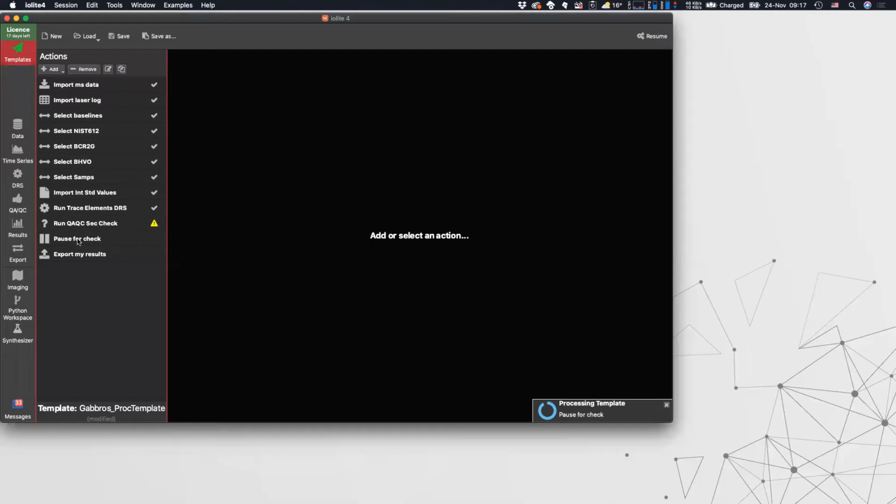And now it's waiting for us to say that it's okay to continue and to export our results. That probably took a couple of seconds, maybe 3 seconds, and I don't think there's anyone who can click with their mouse fast enough to beat that. So that's just to give you a demo of what we're going to try and do.